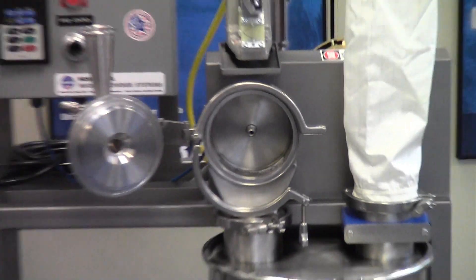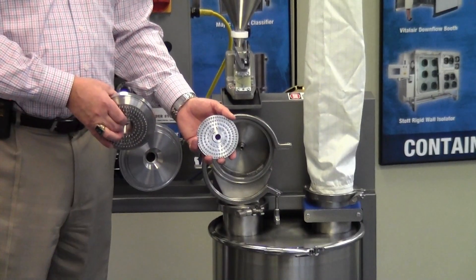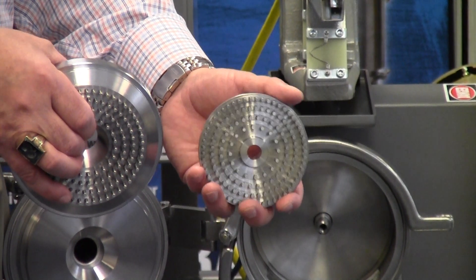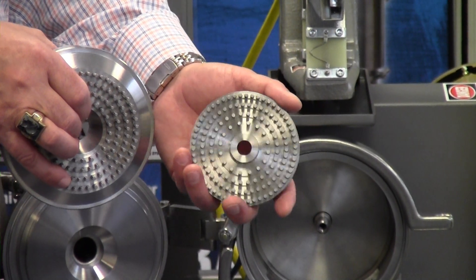We have two other types of grinding elements available for this machine. This is the pin rotor. The pin rotor is typically operated at very high speeds and can produce ultra-fine grinds of a D97 minus 35 microns.